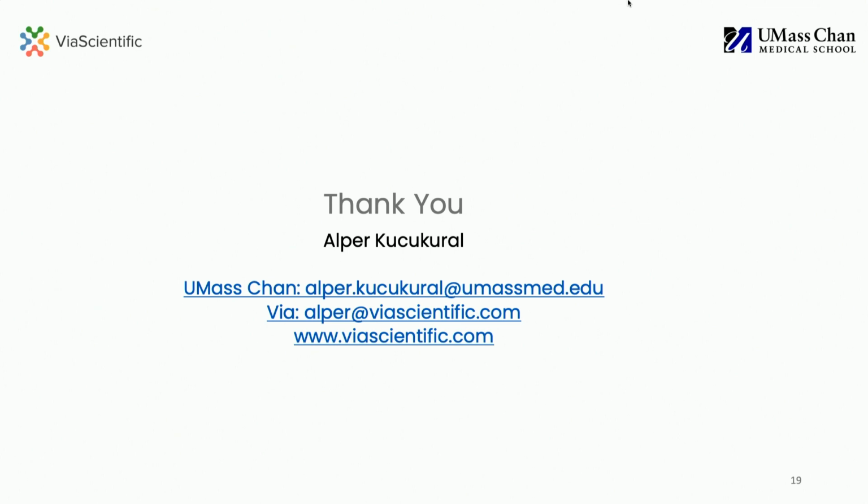One university is using this, and they created more pipelines than we have today. They are giving this service to their users in the university, and they created lots of pipelines. Some of them they shared with us, some of them are private to them. So you can reuse all these processes you created and share them with the users.